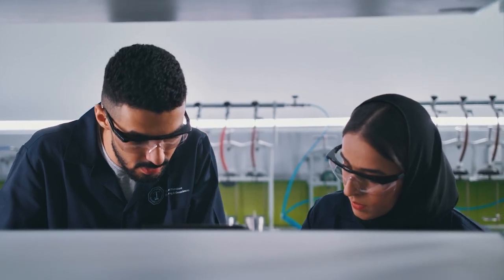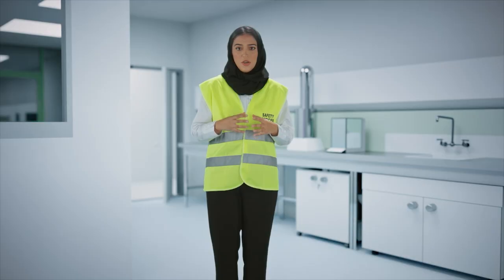PPE is used to eliminate or minimize exposure to some hazards encountered when working in the laboratory. Do not depend solely on PPE to protect you because it is often the final barrier between you and exposure. PPE should be taken off before proceeding outside the laboratory.